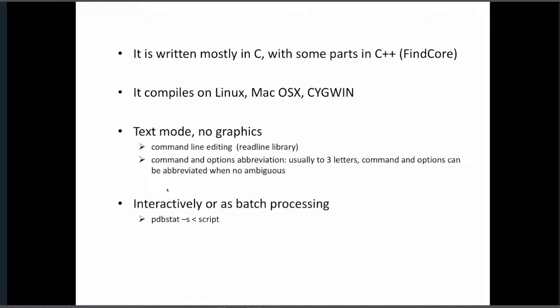The binaries accessible from the web page are mainly for Linux and lately for Mac OS X. Actually, lately I have a Mac, so I am developing the software on this platform and then compiling, making sure that the results are the same and that everything compiles properly. I even made a version for my students in Valencia who use Windows, using Cygwin, so they were able to use the commands.